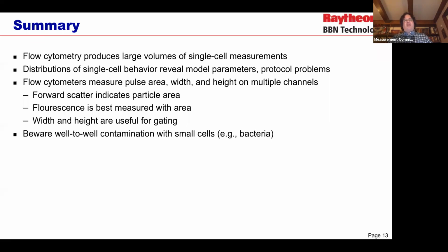Is there any predefined angle between the laser light and the detector for fluorescence quantification? Not quite sure what you're going after there, but to the best of my understanding, the actual structure of the light path is very instrument dependent. And because of the nature of how lasers work, you're basically sending stuff on a straight path and just bouncing it off of mirrors.